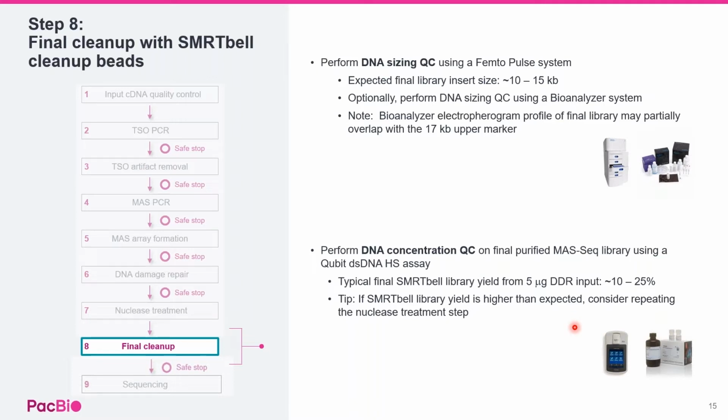If the library has a shoulder of smaller insert sizes, it might be that the library was incompletely digested. So in that case, consider repeating the nuclease treatment step for another hour before sequencing the final library.